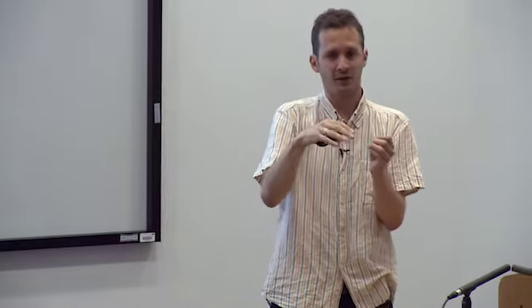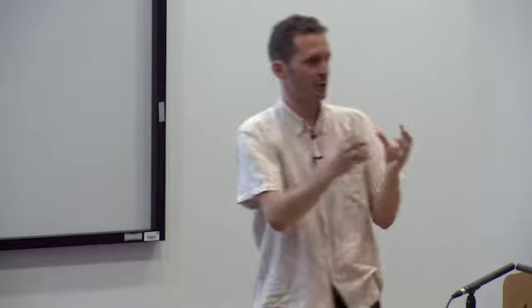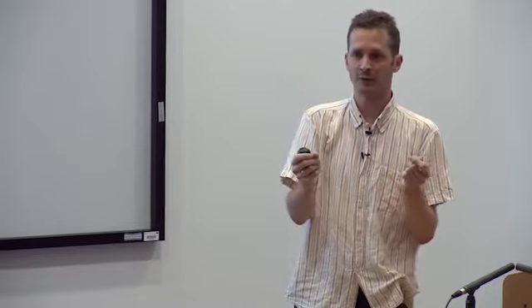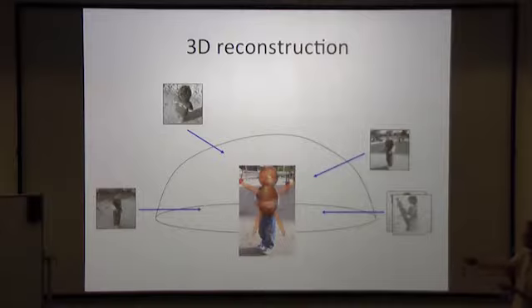And because the images were so noisy, all these orientations are slightly wrong, and they're wrong in a systematic manner that tries to reproduce the orange puppet. And that's the template bias, and people have called it Einstein from noise as well yesterday. But hopefully what we get out is somewhat more like a real reconstruction of Jan than we started off with.